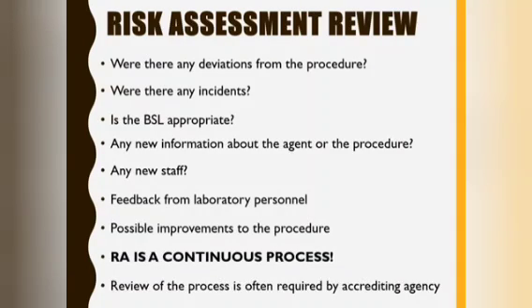Remember that risk assessment is a continuous process. The review of the process is often required by accrediting agencies.